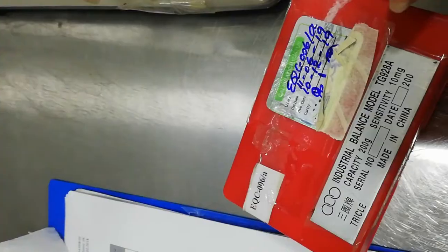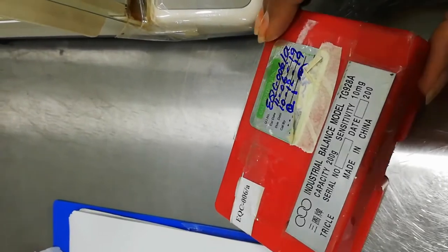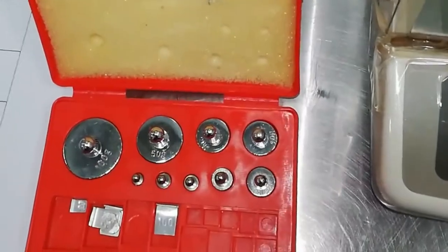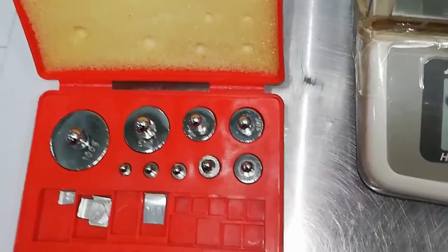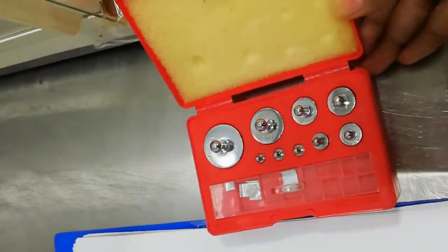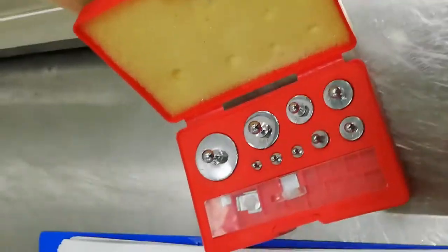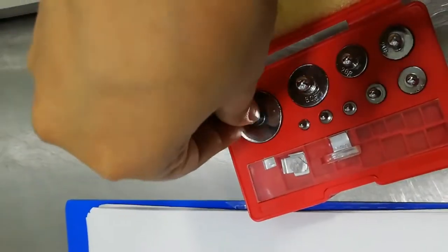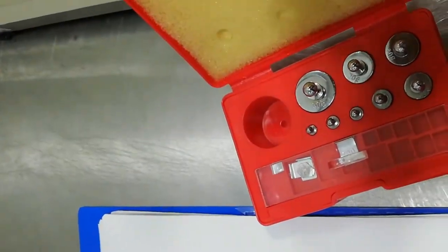We calibrate analytical balances yearly or as per frequency from outsource agencies, but internal verification on a decided frequency is also very important in industries or labs. For this purpose, we use a calibrated box — that is, a calibrated weighing box. Let me show you the sizes of the different weights.